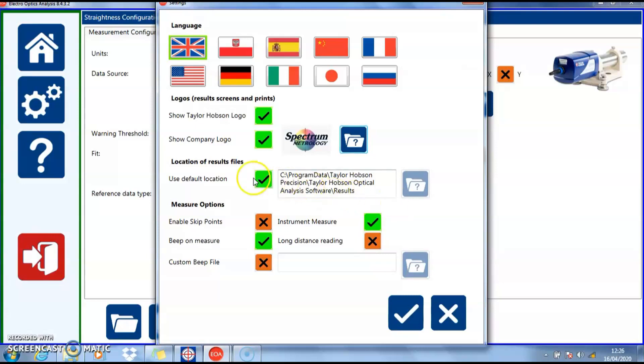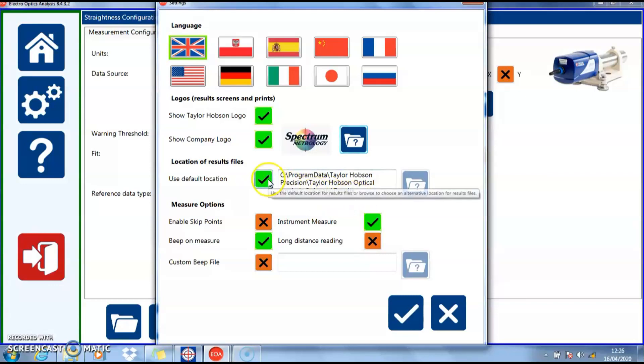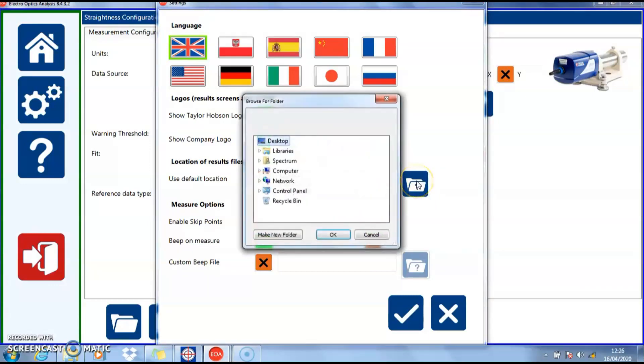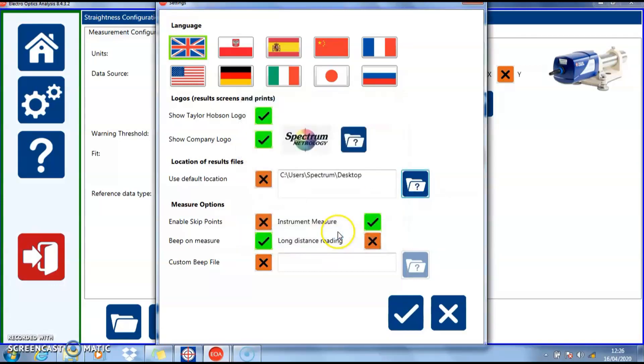This is the default location of any results that will be saved in this folder. If you want to save it in a different position, you can choose anywhere on your computer or even a network location. In this example, we'll use the default settings.